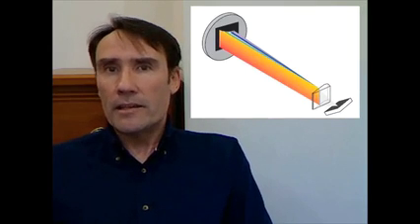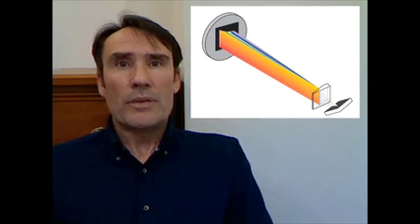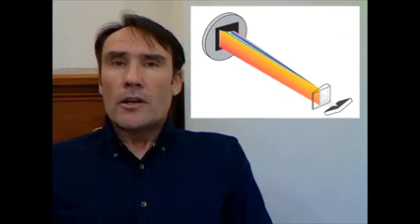Now this detector is a two-dimensional array of pixels, and a pixel is a photoactive component. The common detector in ICP-OES is called a charge-coupled device. Now the CCD in an ICP-OES is quite specialised because it's able to detect both UV wavelengths of light and visible wavelengths of light.